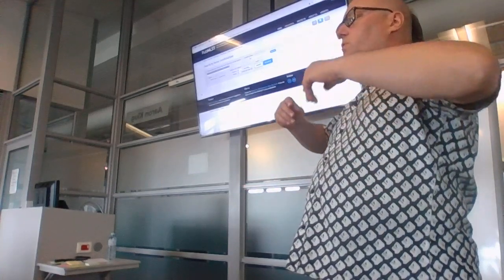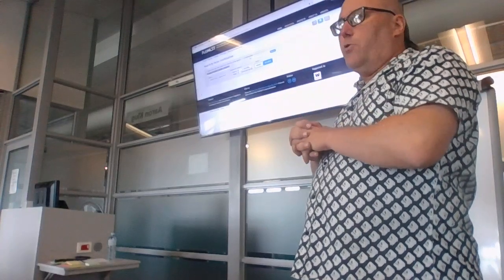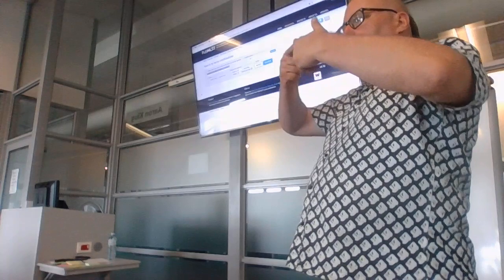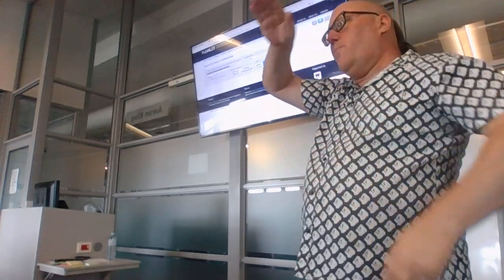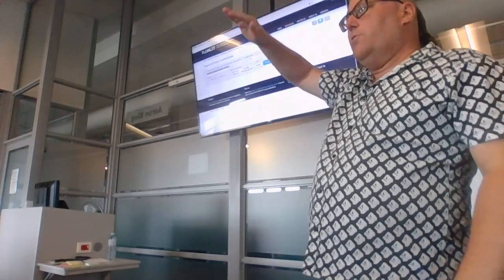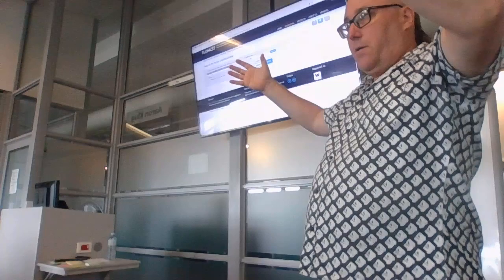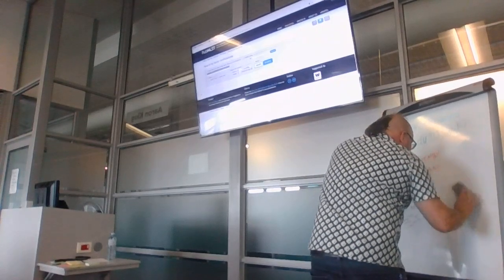Then what you do is you find the overlaps between the reads, typically with short reads using an approach called the de Bruijn graph. And then you stitch together the reads. So if this one's overlapping with that one, and then it's overlapping with the next one, you find a path through all the reads that allows you to stitch together a bigger chunk, okay? Let me just do a quick intro to how that works.